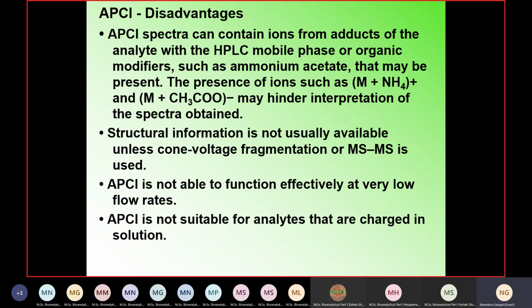But in the case of a mass spectrum, I need both. I always need the fragments and I need the molecular ion. If I am able to give only the molecular ion and very, very few fragments, then there is a difficulty. As in EI, there are more fragments and less molecular ion formation, and then also there is a difficulty. So I want both the molecular ion and fragments. Since this is a softer technique, there is less formation of fragments and so it is difficult to interpret. So I need to do MSMS in order to get more and more ions.